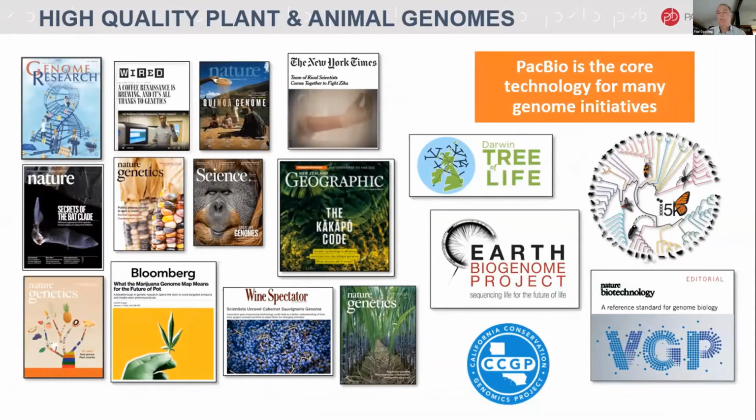So I suppose what I'm trying to say here is that genome sequencing and assemblies using PacBio data is now really quite routine, and the list is out there if you scan the literature. All the top publications are showing high quality genome assemblies from all sorts of eukaryotic life, really weekly. If you look at the journals, it's there all the time.